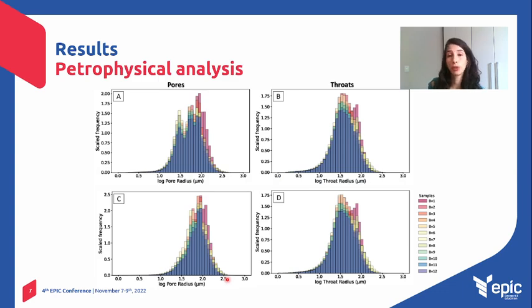And now in the petrophysical analysis, we obtained some results. The porosity estimated here by the high resolution CT scan ranged from 7.5 to 12.5%. Even in a high resolution, the CT scan porosity of the plugs was underestimated compared to the gas porosity. Apart from the porosity analysis carried out by the software, many relationships could be established with the studies of the pore network modeling, or also PNM.